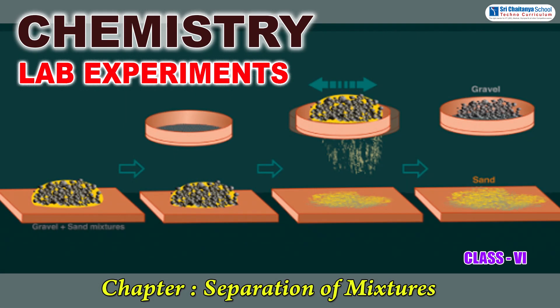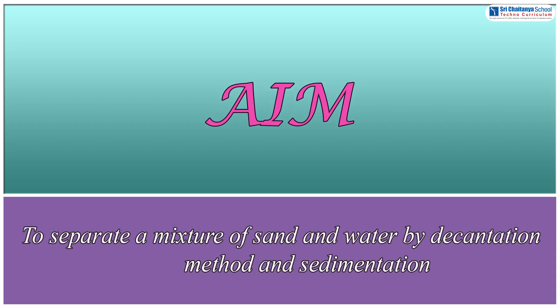Hi children, now we are going to do a chemistry lab experiment. This experiment belongs to the sixth standard and the lesson name is separation of mixtures. The aim of this experiment is to separate a mixture of sand and water by decantation method and sedimentation.